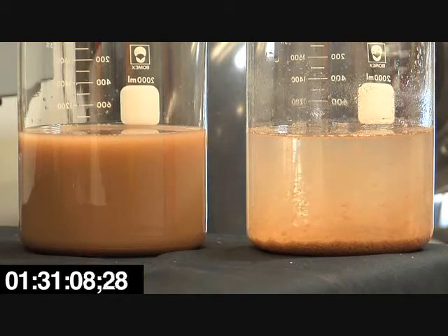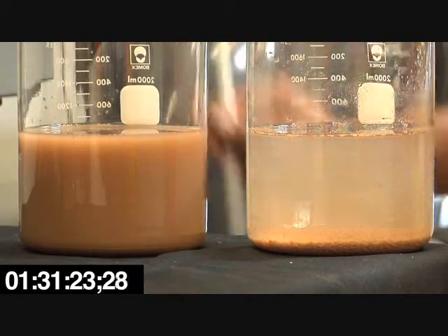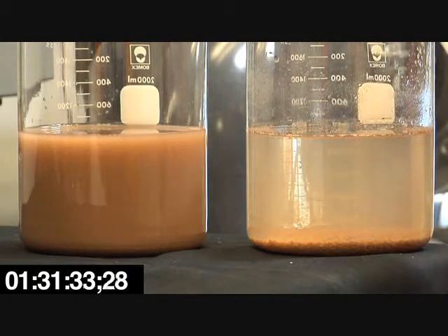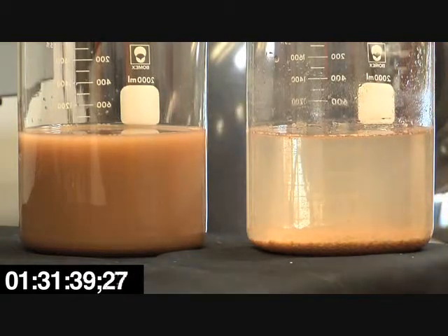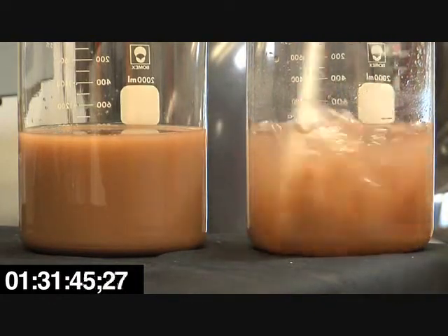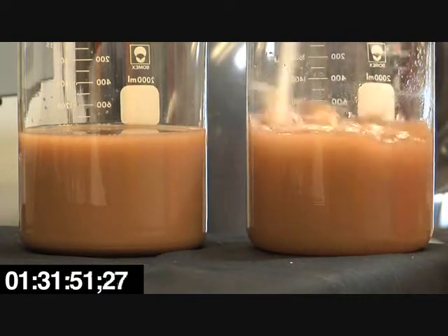In a pre-treat situation, you let that settle out. And in this case, you still see some sediment in the upper water, and we'd hit that with a small amount of chitosan acetate, which I'll do now. And then it would go to the filter, and the filter would filter out the rest of that dirt water and the chitosan that's in the dirt. So three drops of the 2% acetate would be about three parts per million. And you can see in combination, the lactate and the acetate work even better.